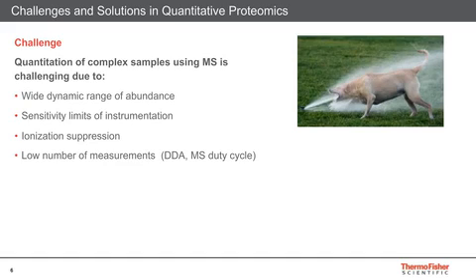post-detection with software. Although Western blotting has not changed much in the past 35 years, the barriers to adoption of LC-MS as an analytical tool to study proteins has significantly decreased over the past decades through improved instrumentation and software.